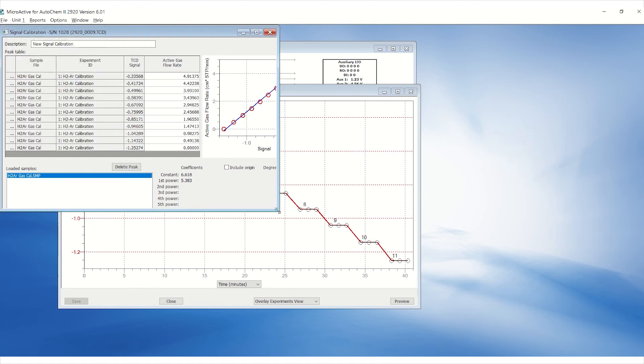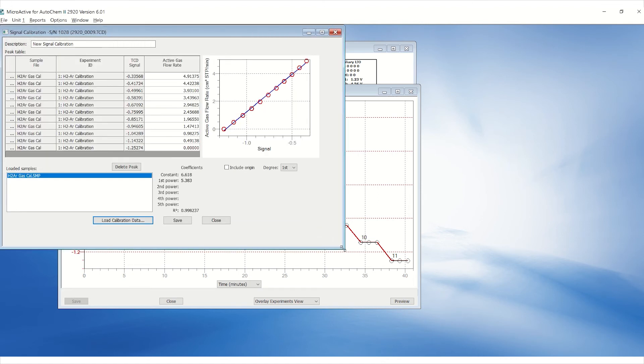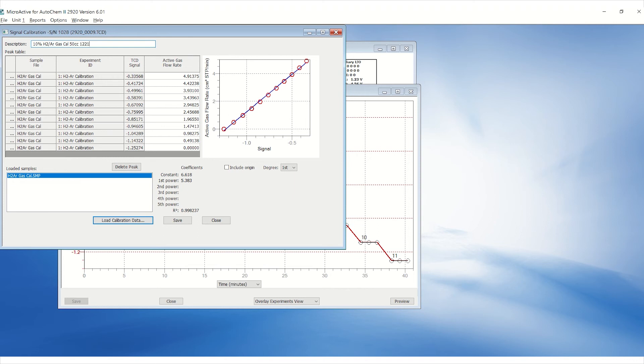Type in the descriptions of the calibration, including the active gas percentage, gas blend, flow rate, and the date. You can select either first or second degree, depending on which one produces a better goodness of fit.